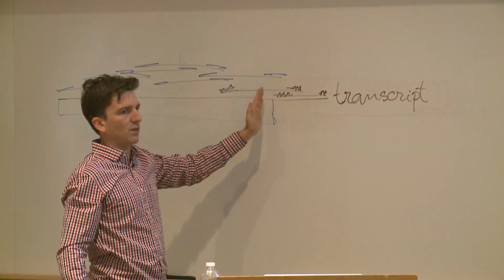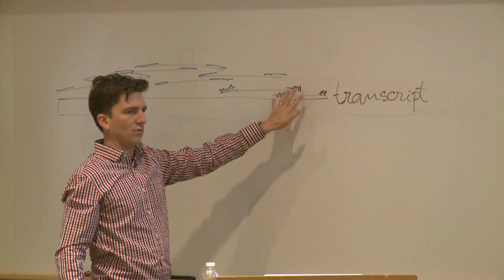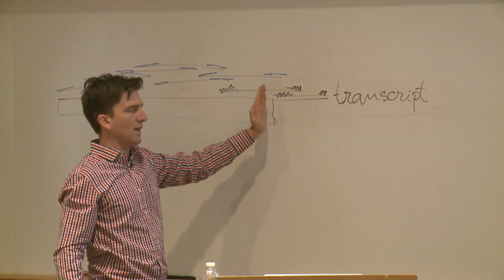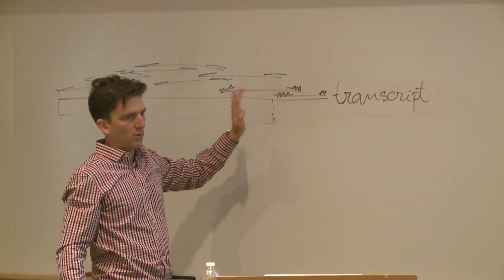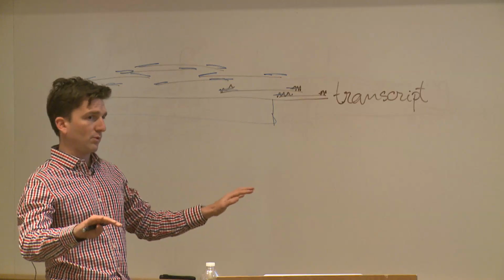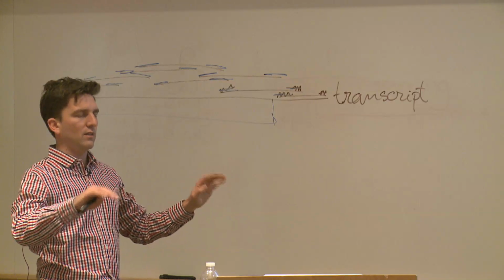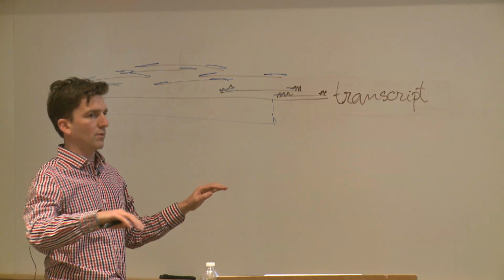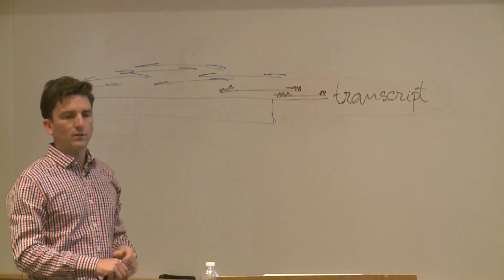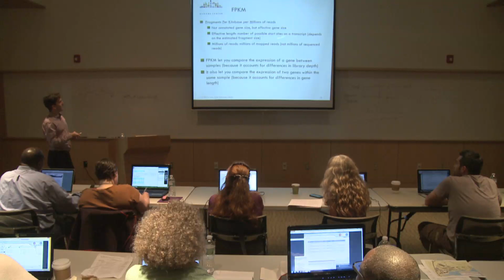So the first step in Cufflinks is to look at the BAM file, the alignment file, and to estimate the fragment size. And from the fragment size, it estimates the effective sites per transcript. But that's something to consider, because if you compare two different samples that were sequenced at a very different time, with different people and different technology, the fragment size might be very different, right? And so that measure can vary. So that's what they mean by kilobase, the effective gene size.